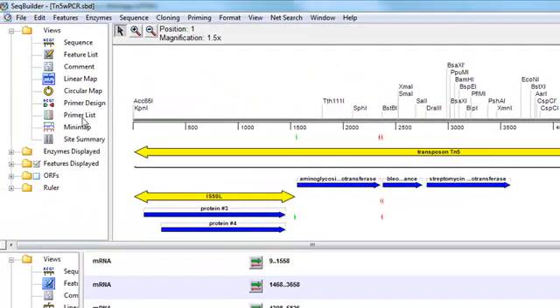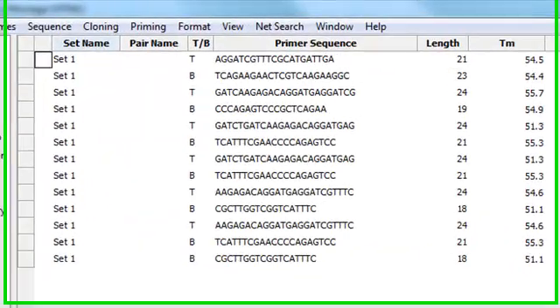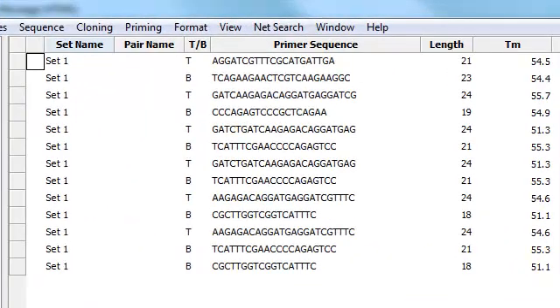And if I go to the Primer List view, I can see the 13 imported primers listed here as well.